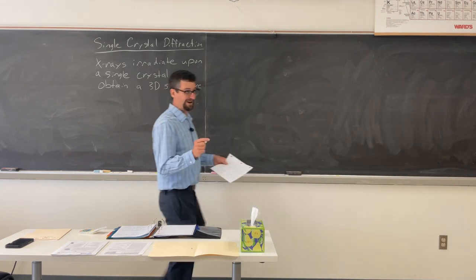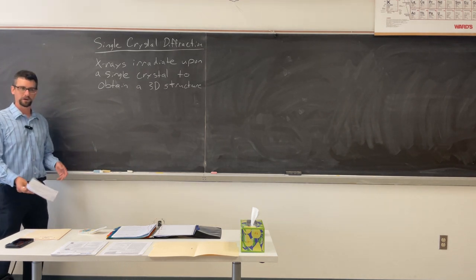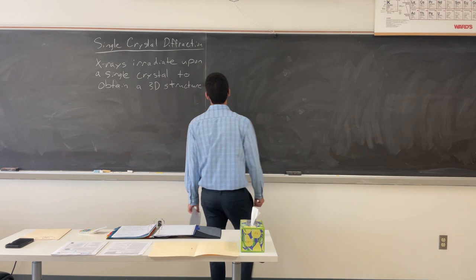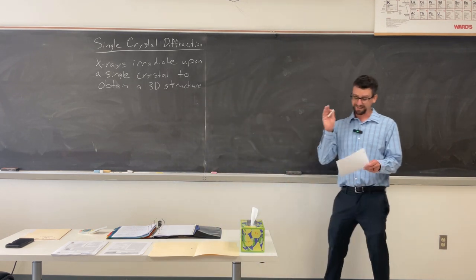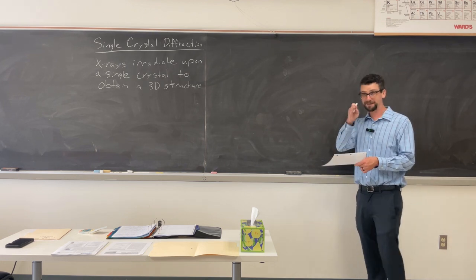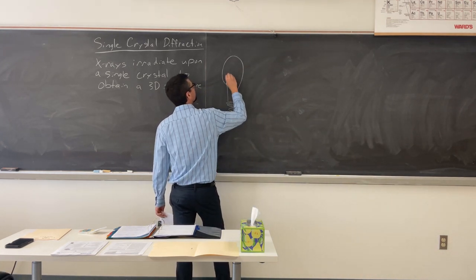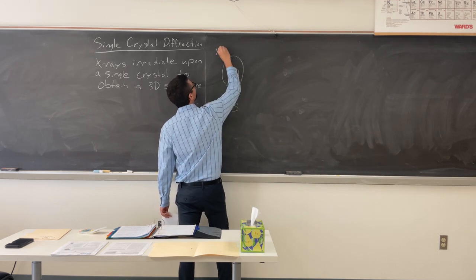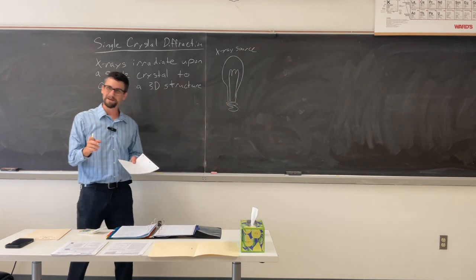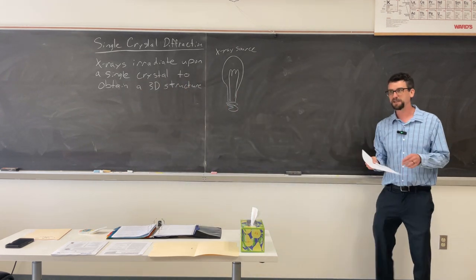Okay, rah rah Fredonia. Let's talk about the schematic now. What are some things we need in our schematic to describe the experiment that's going on? We will need a detector. Right. I don't want to draw where the detector is. Yeah, we need something to shoot X-rays. I'm drawing it as a light bulb. It's not a light bulb. There are multiple X-ray generators. Does anybody know any of these?